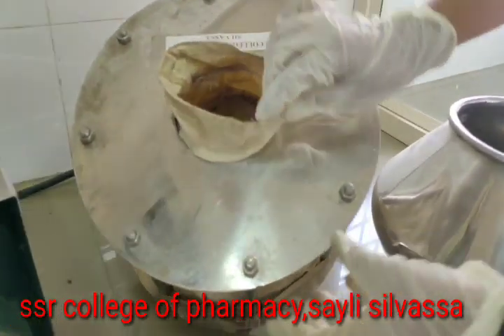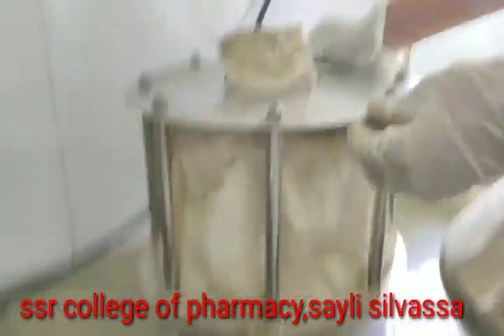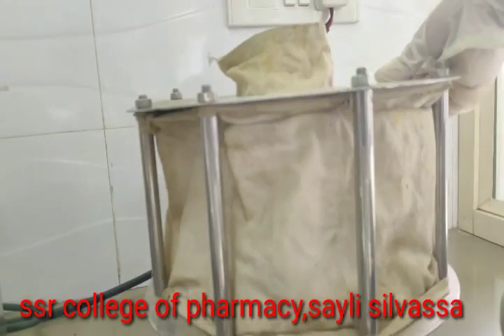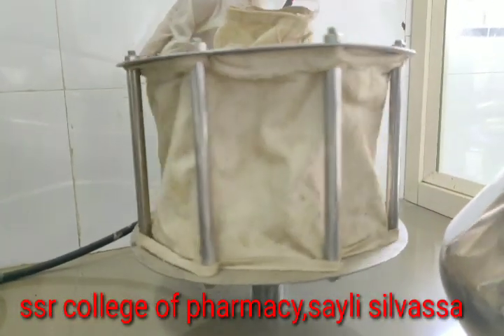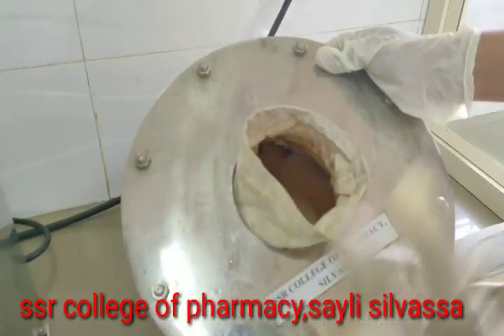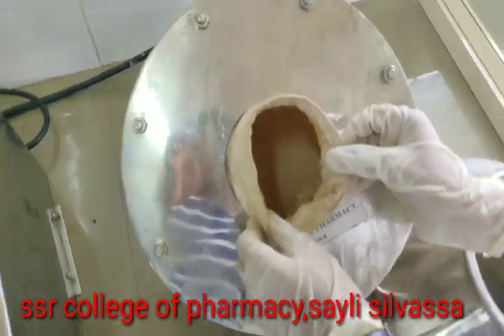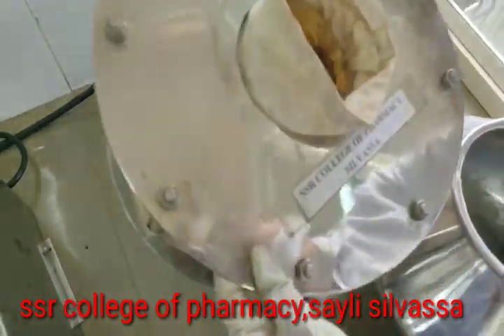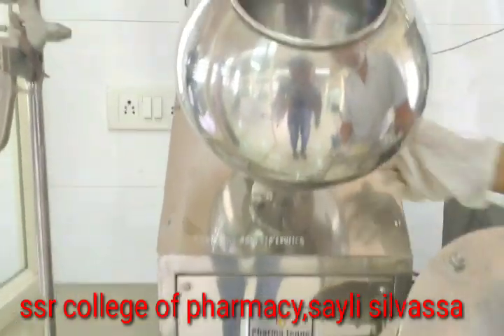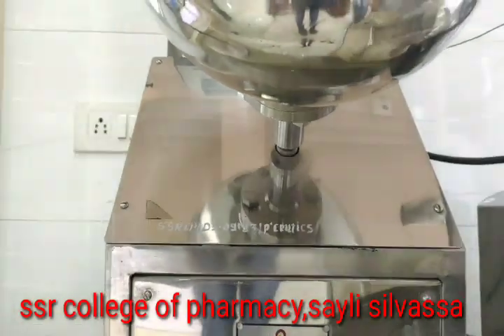Then we have the polishing equipment. For polishing the tablet, after the coating is done, we will fill the tablets inside this container and attach it over here.